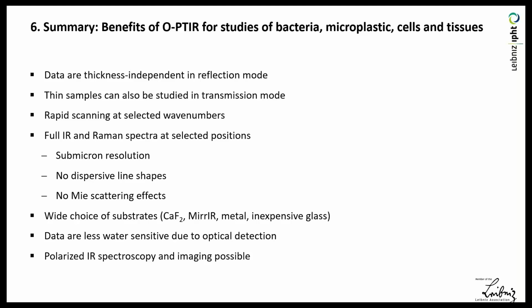Of course, you could also automate the whole process of cell identification and collection of spectra, and then move from one cell to the other. Our dream is to automate the data acquisition process, and then you can easily collect more than 5, maybe 10 spectra per cell, and then you have an even better average.